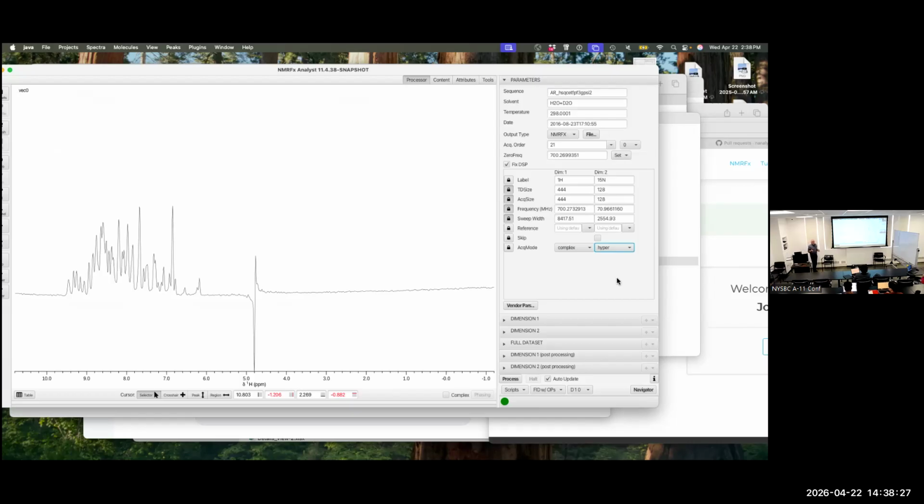And so how much signal improvement, other than, as Art pointed out, the losses from any additional pulses you might have, what should you gain in doing that? What factor of improvement is signal to noise? Root 2, yes. Basically, the same as always when you're averaging NMR signals. The actual signals go up proportional to the number of values you average in, but the noise also increases, basically as root two. So overall, you get a root two gain.